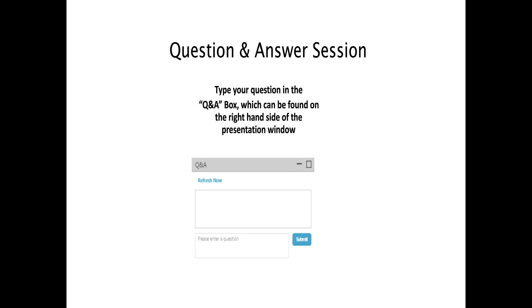In any chromatographic situation, the goal of one chromatographer is quite different to another. So it really very much depends on whether you want polar analytes to elute first, or obviously the less polar. So that would be a consideration. So in answer to the question, yes, it's quite plausible.